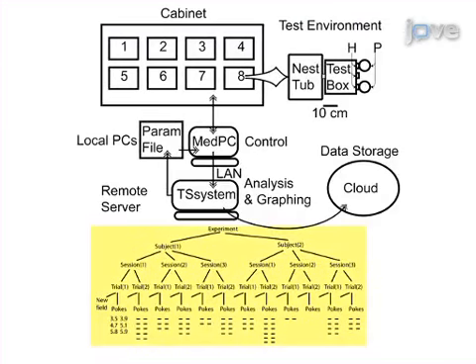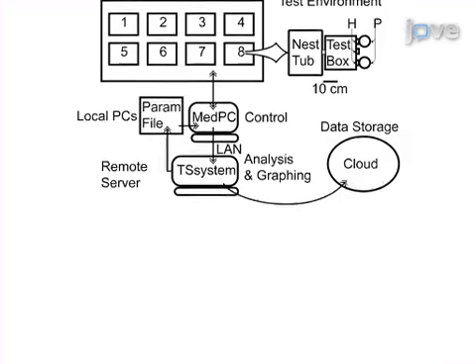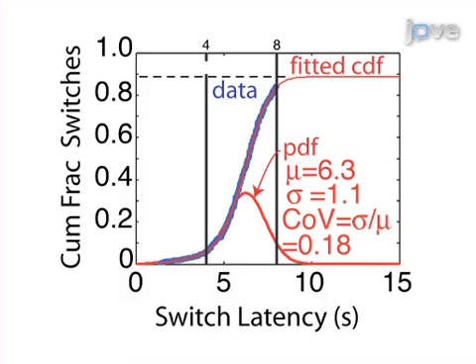Next, the raw data, the test protocol code, and all intermediate statistics are archived in a single data structure in order to make the data publicly available and encourage further analysis. The results show strain-specific alterations in the temporal Weber fraction based on the switch task.